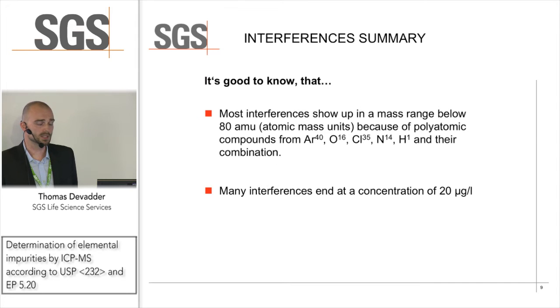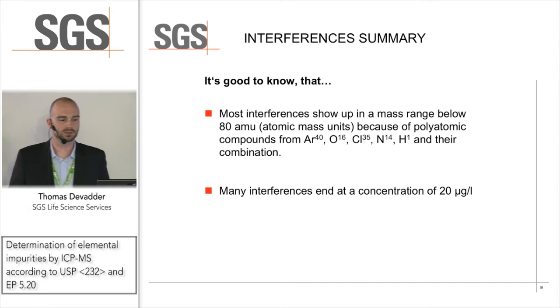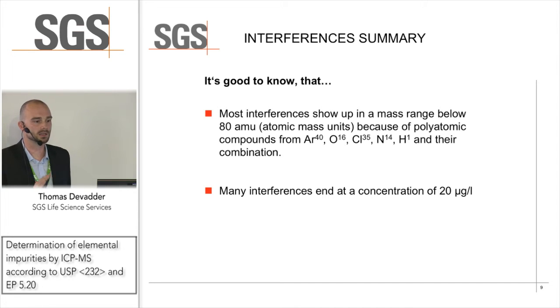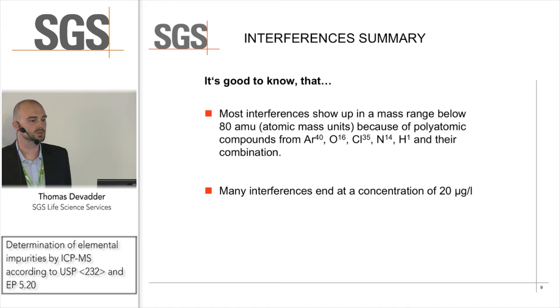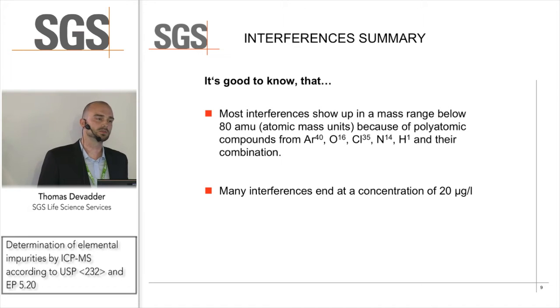Just a quick summary: it's good to know that we have the worst interference at mass 80 — that is selenium — due to compounds of argon species. Many interferences reach an end at a concentration of 20 micrograms per liter.